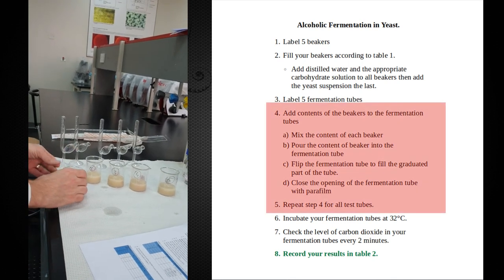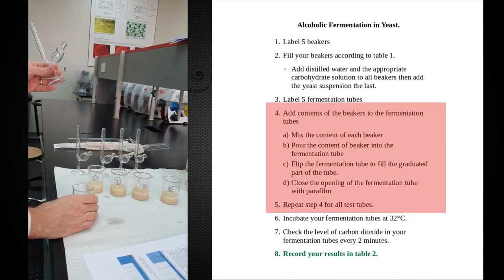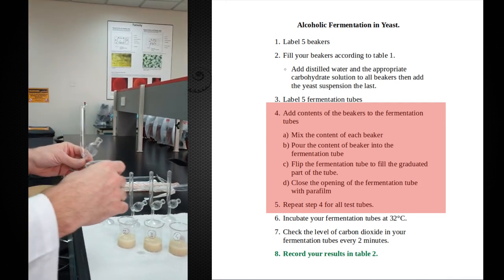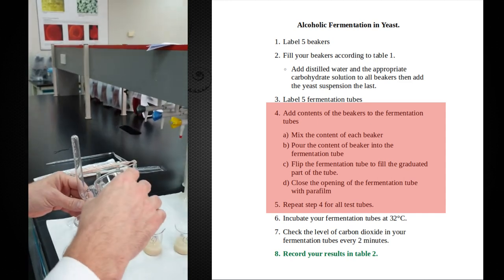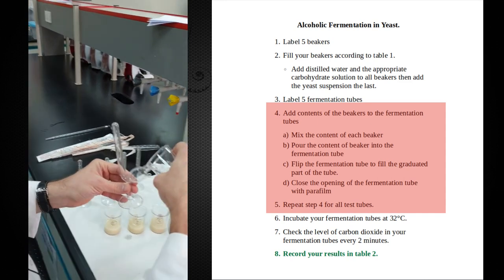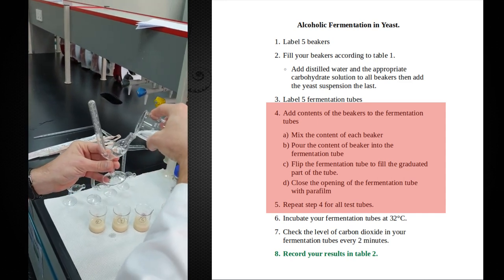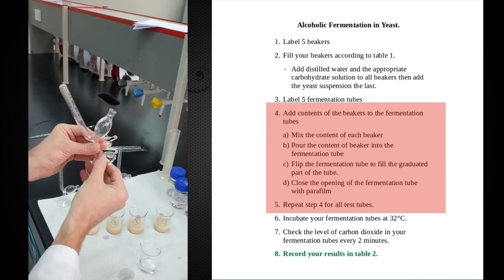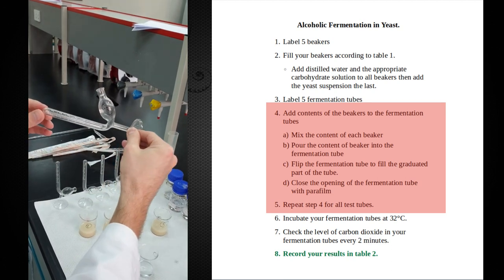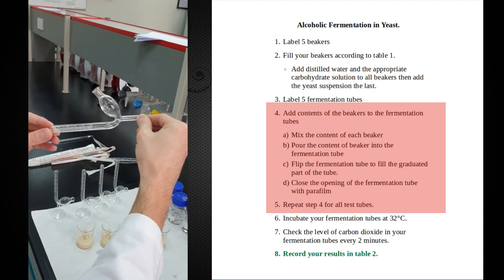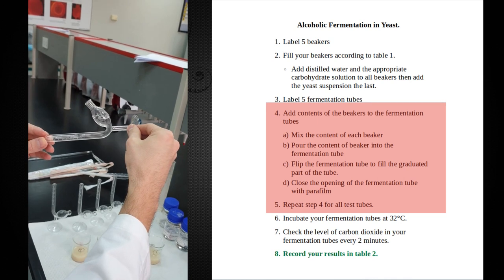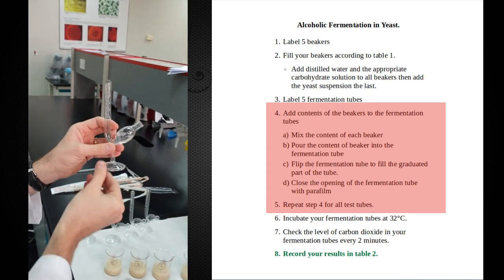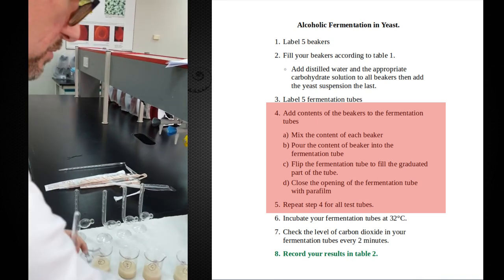Transferring to fermentation tubes can be a little tricky. They won't really let you just pour things in very easily. Mix it and then pour it in. Fill it out as much as you can, and then you have to turn it. Don't be shy about it, don't be afraid. There you go. So now we fill this whole area here, and I'm going to leave it like this. I'm just going to seal it off using parafilm.